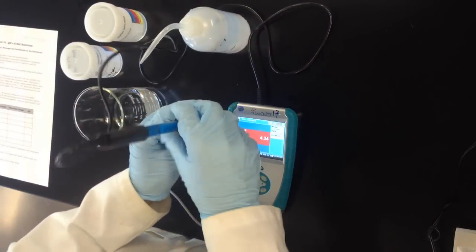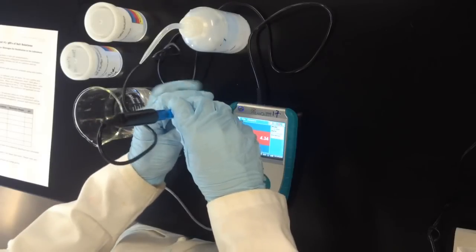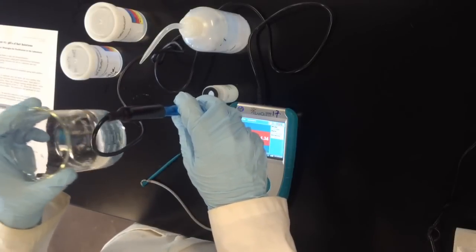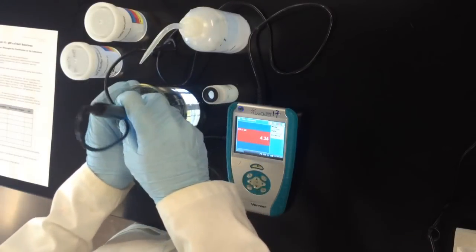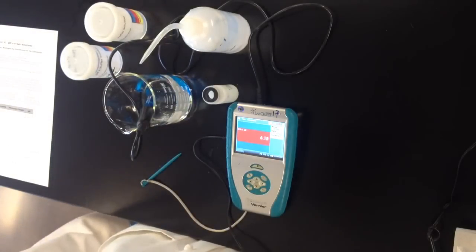So the first step is to unscrew the storage capsule here and take out the pH probe. I like to keep a beaker of distilled water around. It's good to catch washings that we'll use later and I often will just store the pH probe in this distilled or deionized water.